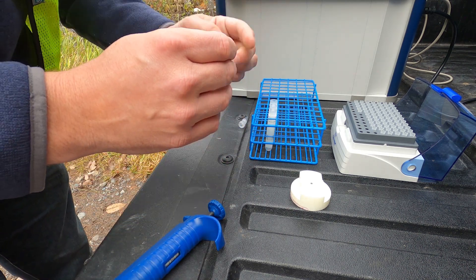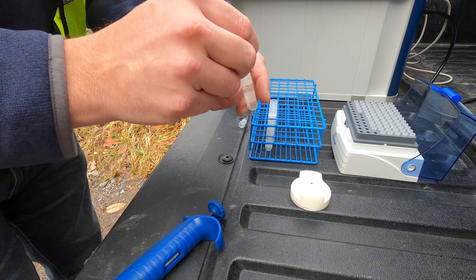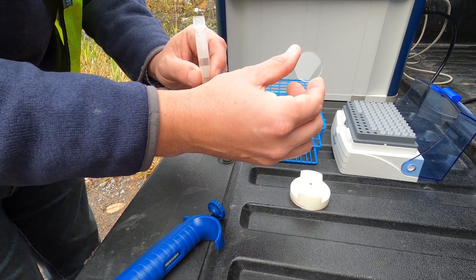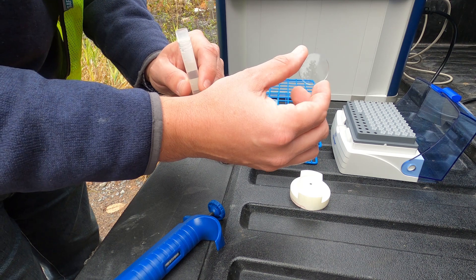We will then shake up our water sample and pipette five microliters of water directly onto the TXRF sample carrier. Today we are using acrylic sample carriers, which are thrown away after each use.